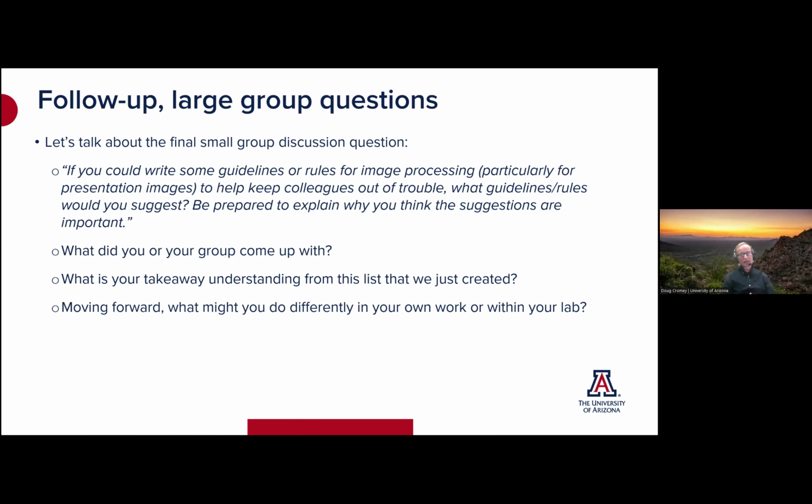One of your best protections against an accusation of fraud, or misconduct or cheating, however you want to call it, is to be able to produce that original data. So that's gold. You really want to make sure that it's protected and safe, because you can make mistakes. That's why you work on a copy. Always on a copy.